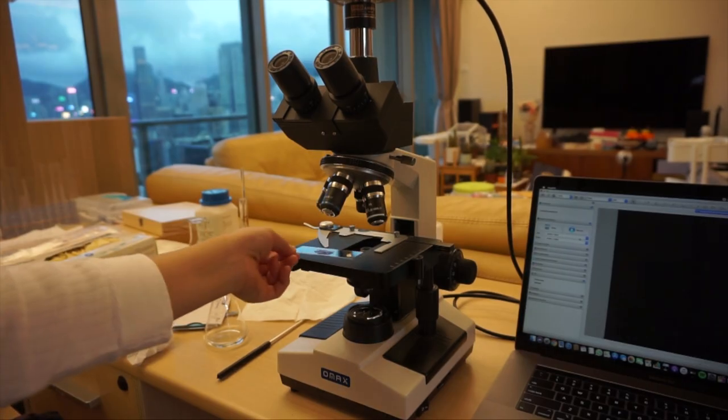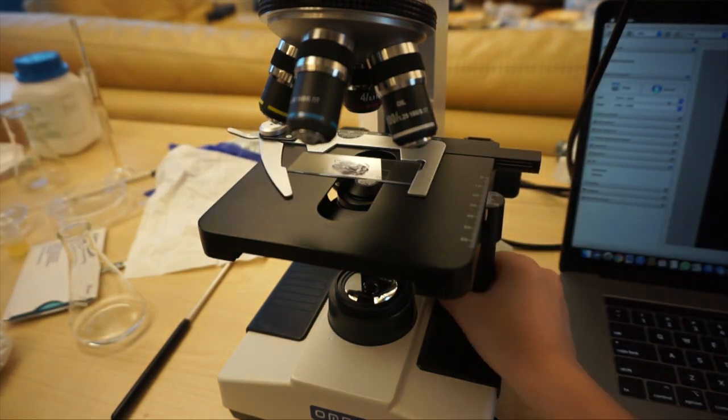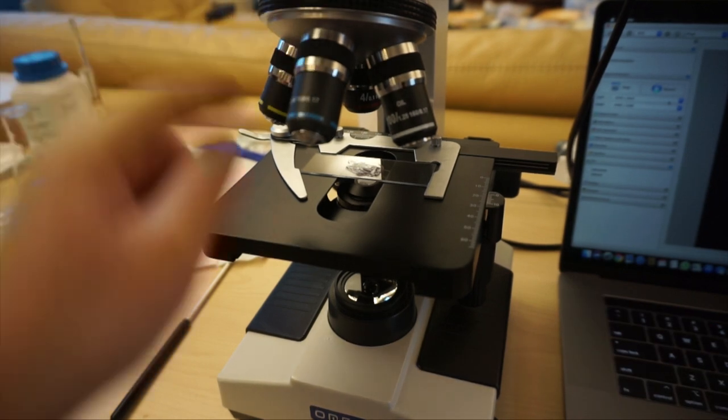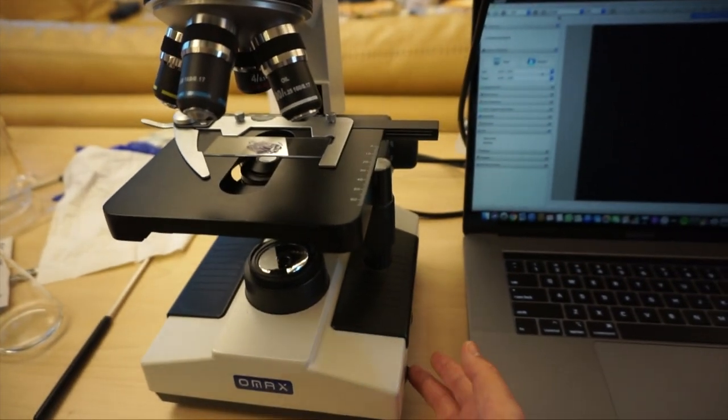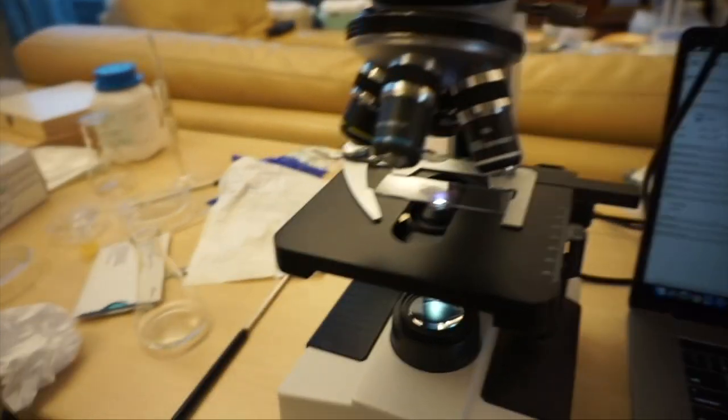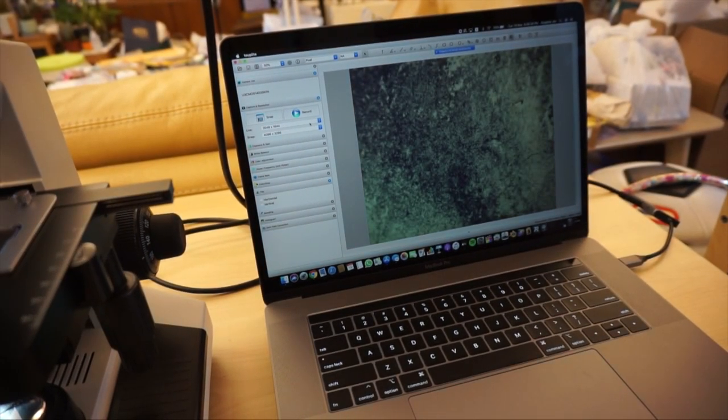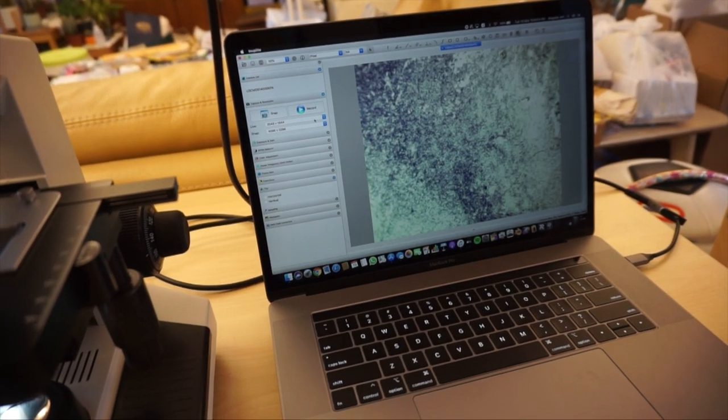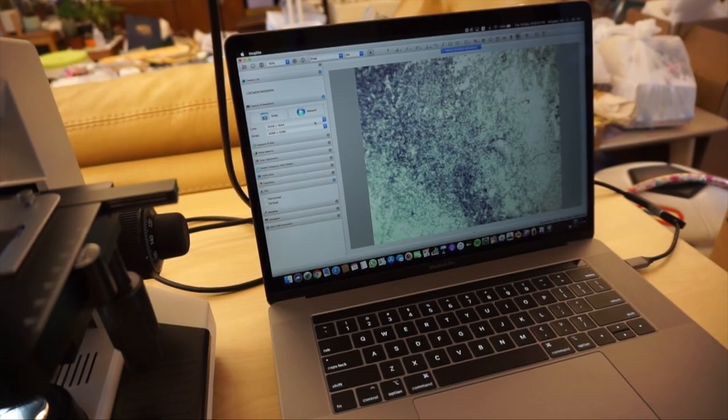I'm going to load the bacteria slide into our microscope. I'll set clamps and move the stage to the center position. And then start with our 4X objective. It's just a normal 4X objective. Turn on the microscope. Now start seeing there's light. So I'll adjust the coarse focus knob up until it focuses. Here we can see that I smeared too much of the bacteria on top. So instead of picking up the whole colony, if it's a really big colony, just touch the loop and you'll get the bacteria already.